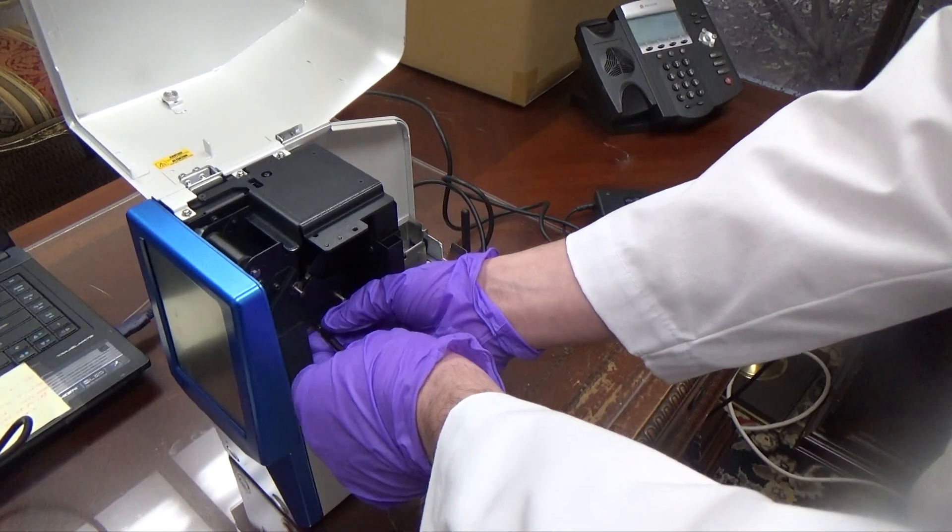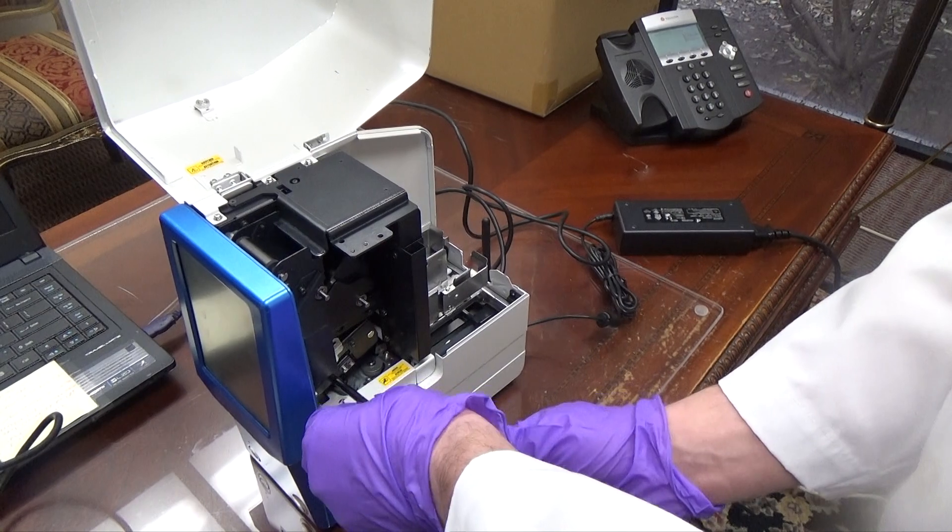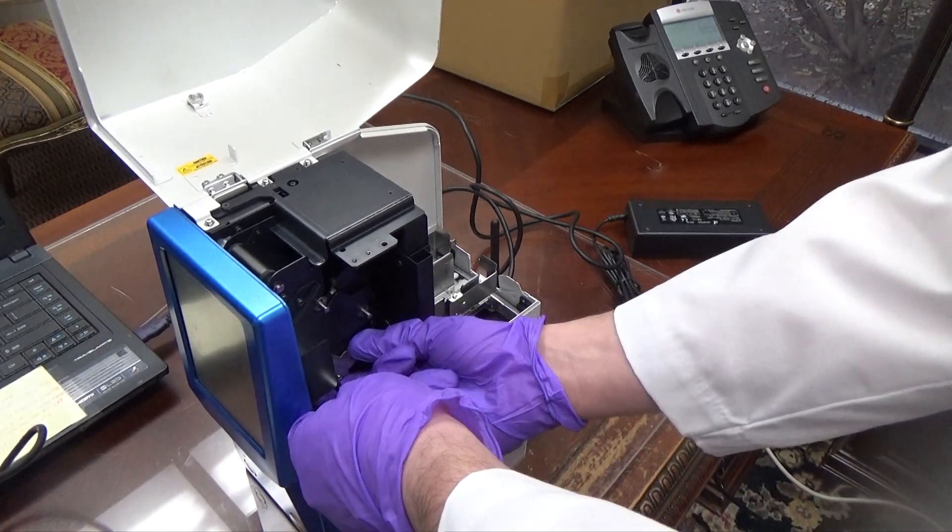The first step to operate the ESPO printer is to remove the four transportation screws in each bracket as shown.